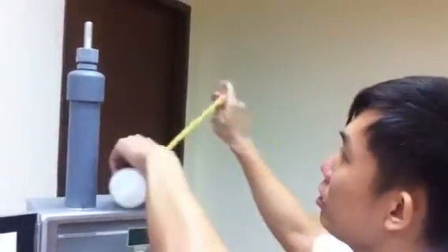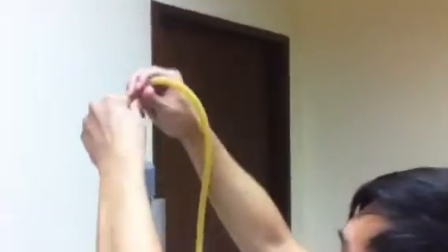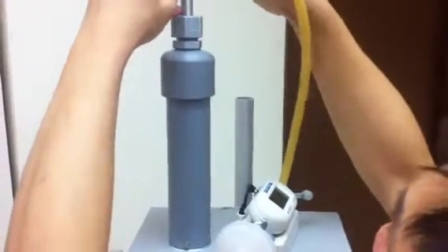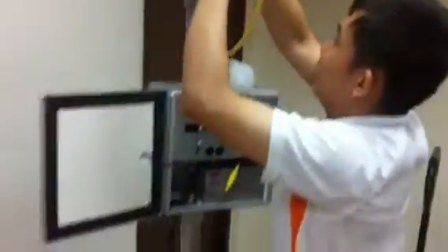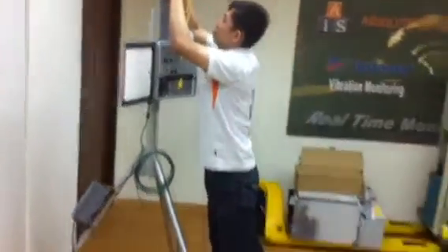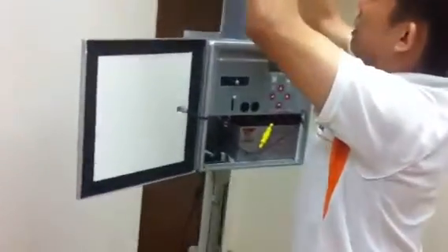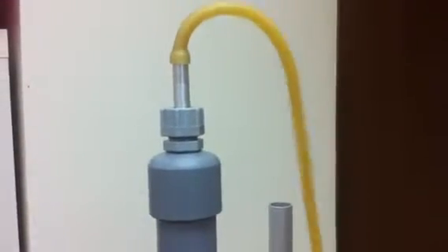Now we connect to the full calibrator. Turn on. Connect to the housing. A bit tight, but still successful. This is the correct way to connect the flow meter.